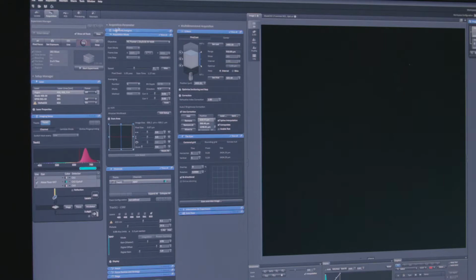We covered it entirely. And then we set the last step here. And then you can see that we covered almost 900 micrometers. Wow. So the complete thickness of our sample. We can even go further, but of course it's sample dependent and also staining dependent. Are there any tricks in the software which one should know?